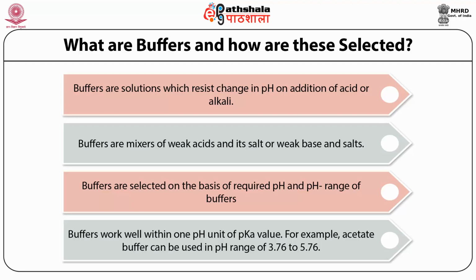Only the buffer can stabilize if the pH range is within 1 pK unit. This is how the buffers are selected.